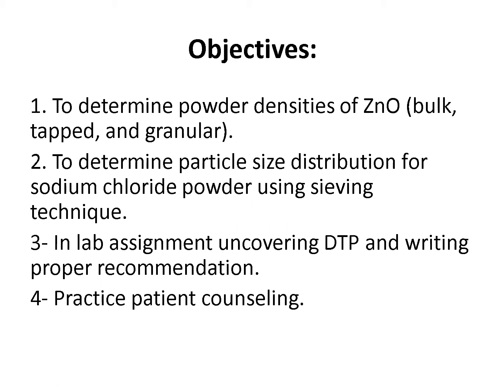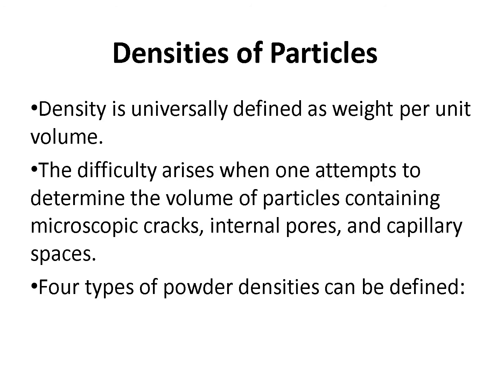So the objective of our lab is to determine the powder densities of zinc oxide, the bulk, tapped and the granular, and to determine the particle size distribution for sodium chloride powder using the sieving technique. There is an assignment in that lab covering the DTP, and the same case in that assignment is the counseling for group 2. Please watch this video on YouTube explaining the practical part of this experiment.